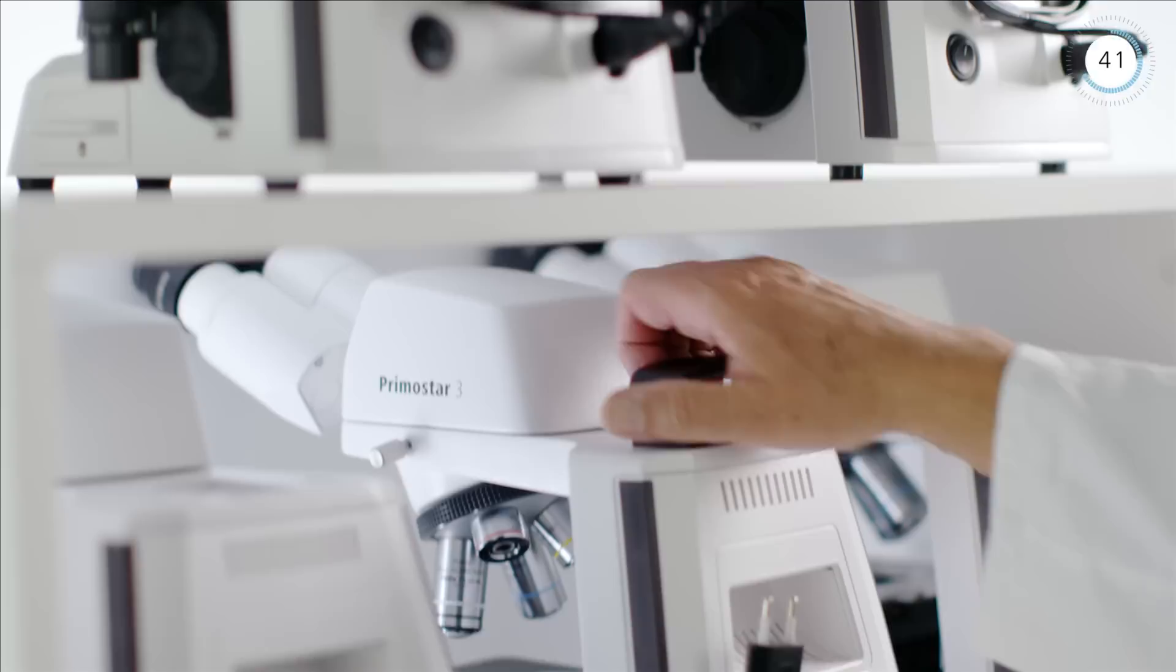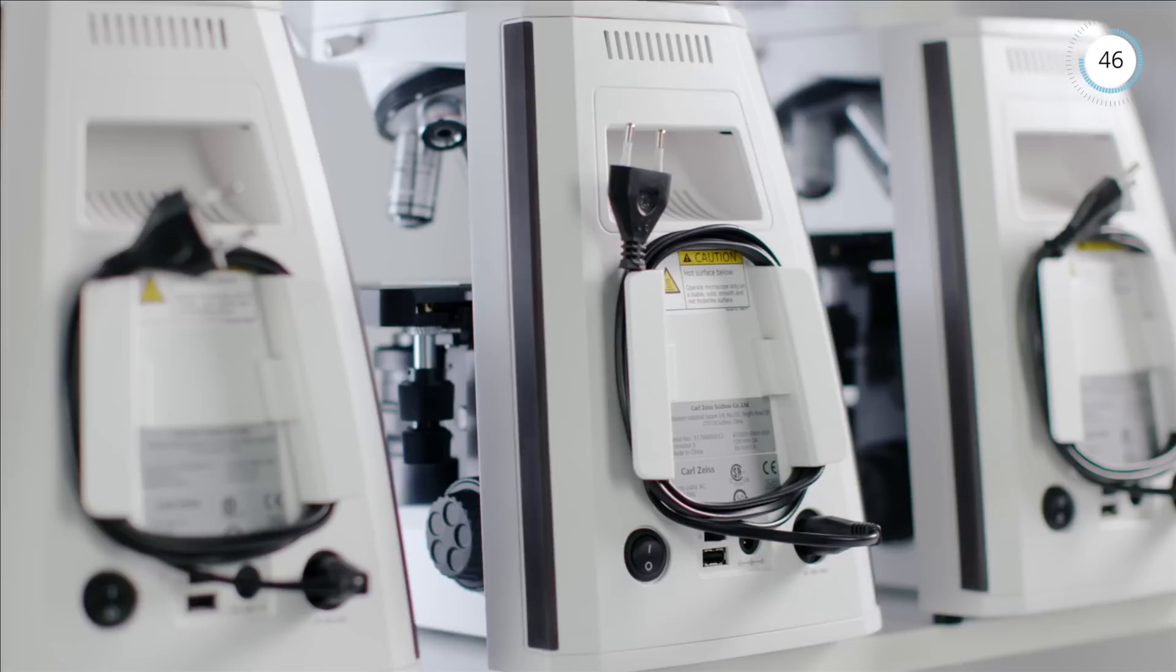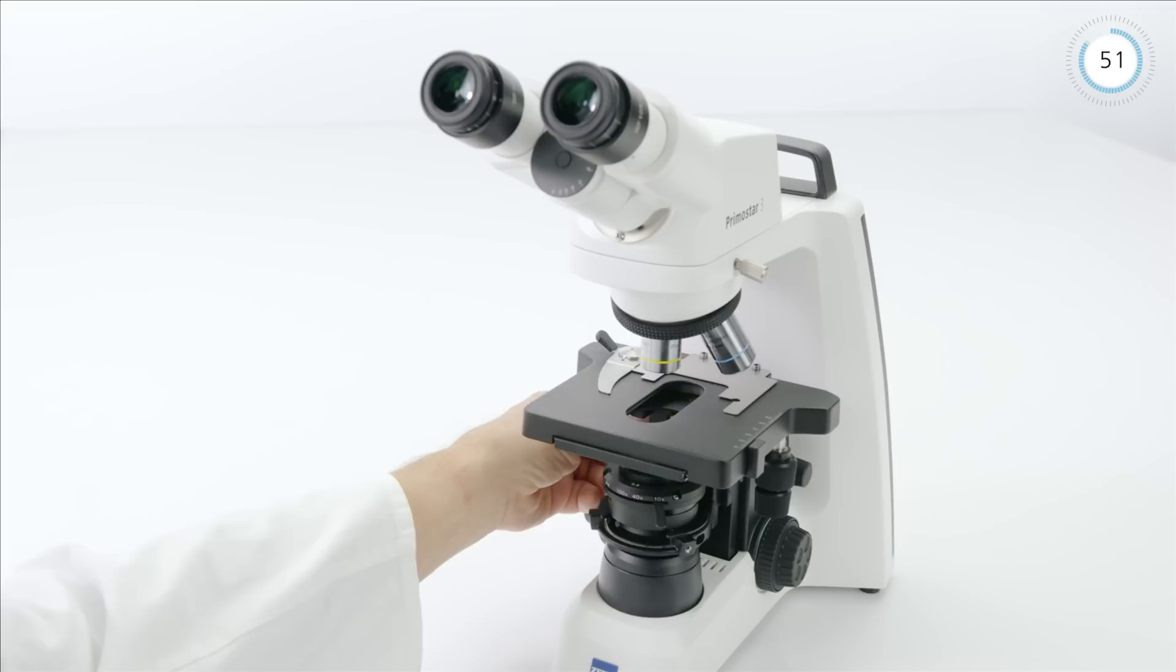PrimoStar 3 houses an array of clever features. The carrying handle lets you move it around safely, and all cables are neatly stowed away at the microscope itself.